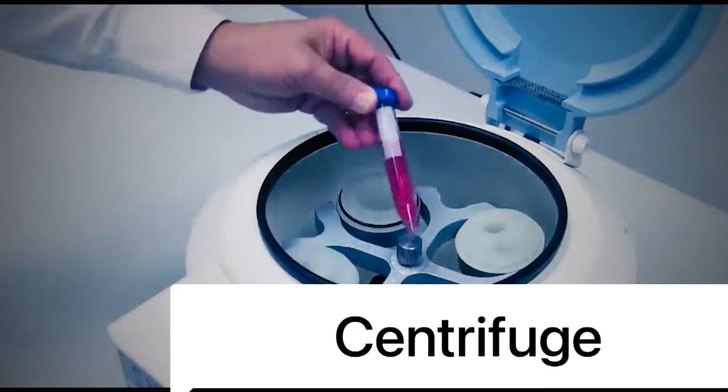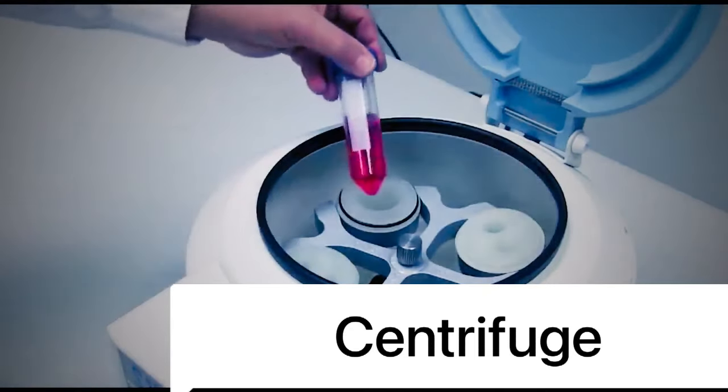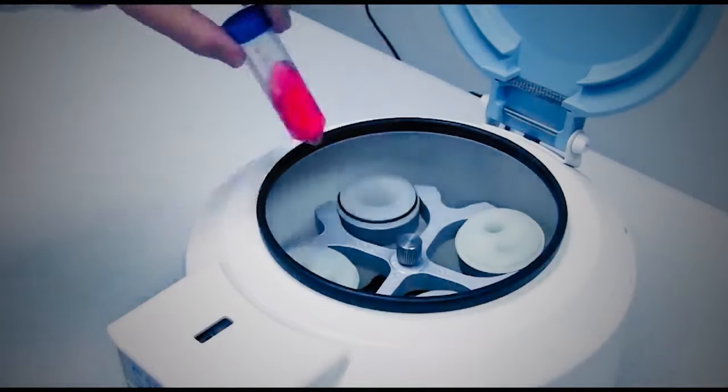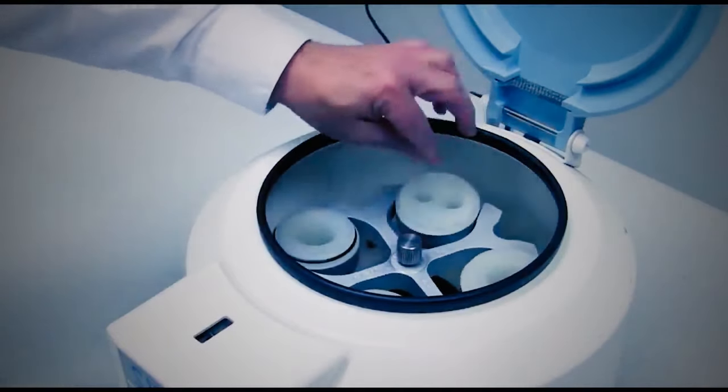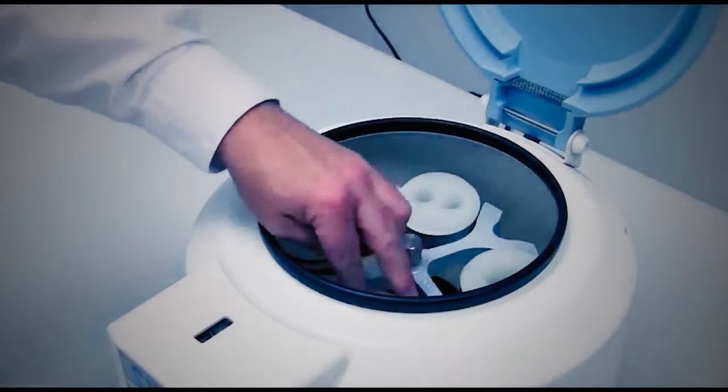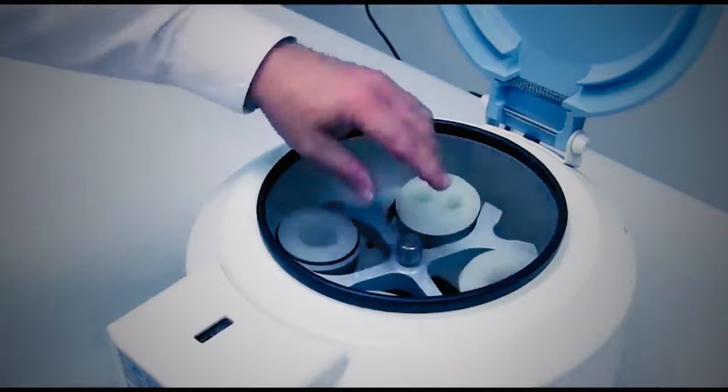Centrifuge. A centrifuge is a laboratory device used for the separation of fluids, gas or liquid, based on density. Separation is achieved by spinning a vessel containing material at high speed. The centrifugal force pushes heavier materials to the outside of the vessel.